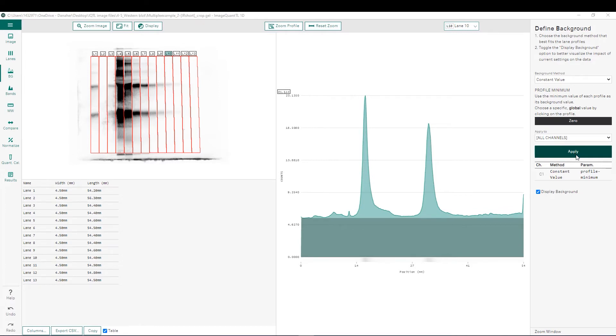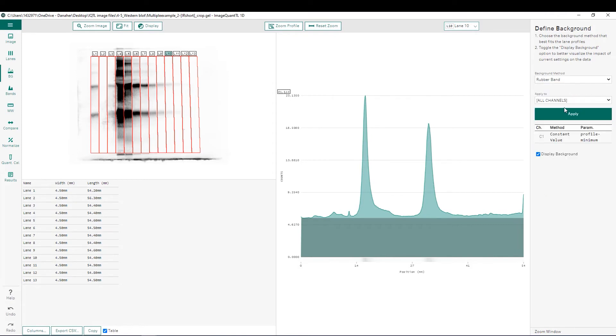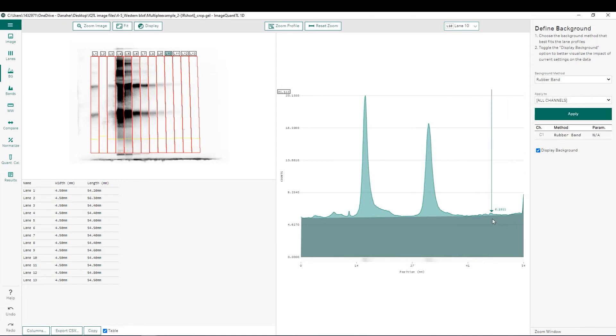The next background subtraction method we're going to look at is rubber band, which provides us a localized background for each individual band within each lane. Rubber band works by taking the intensity at the top of our lane and at the bottom and stretching our rubber band across. If there are any points that are lower in between there, it will contour around those.